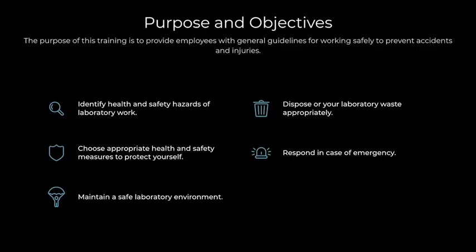Identifying health and safety hazards. When working in a laboratory, it is important to be aware of potential hazards. Some common hazards in a laboratory include exposure to chemicals, biological materials, and electrical equipment.